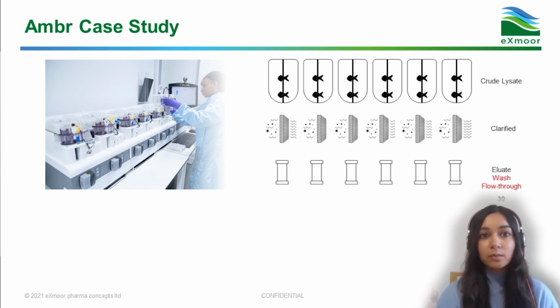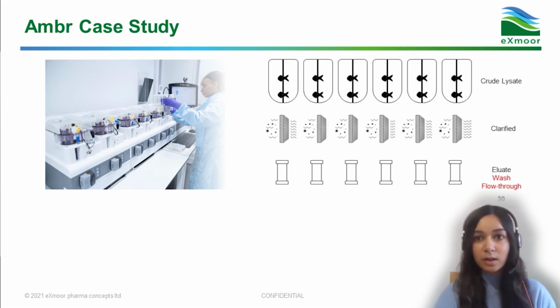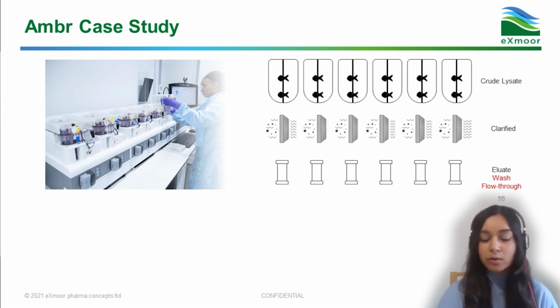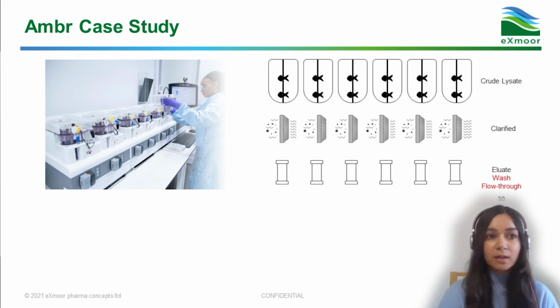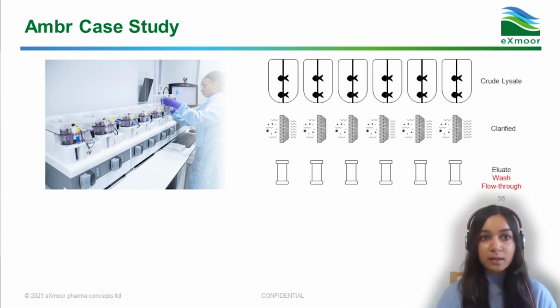And we often purify these bioreactors to assess changes upstream has on downstream. So, for example, we might want to assess changes different culture media has on the process workflow. So, we typically compare the titer of 6 bioreactors and assess recovery across the process workflow. So, I'm showing this as a schematic there on the right of the slide.